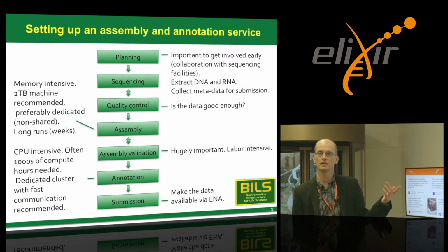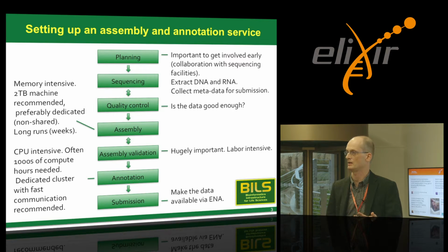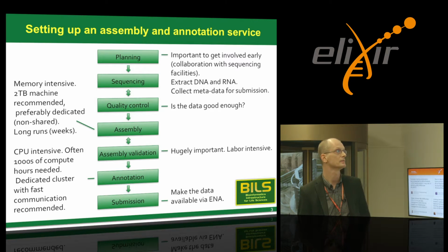You can also collect metadata here, and we help the customers to submit the sequences to ENA. And we try to collect the metadata for the submission already in this stage.